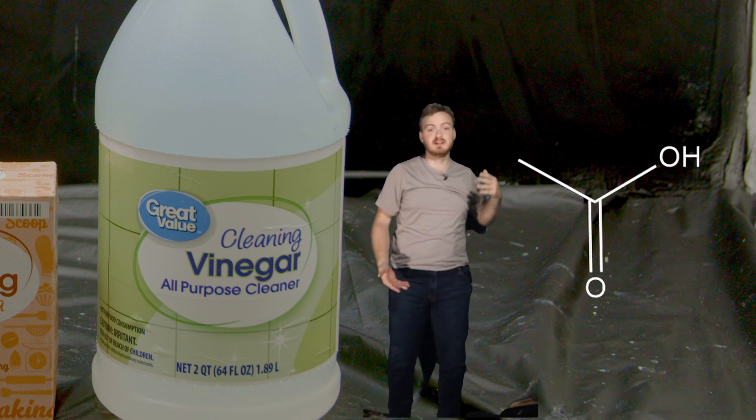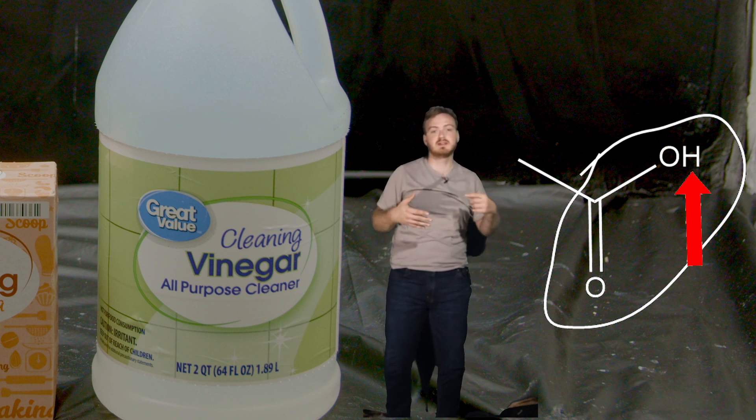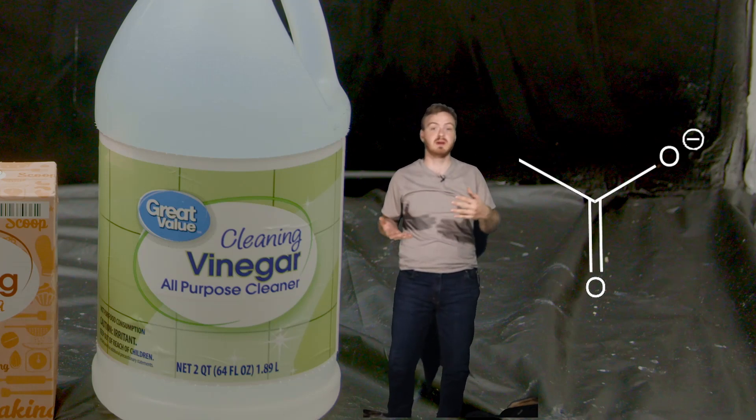You see, acetic acid contains a carboxylic acid group. This carboxylic acid group is really prone to losing its hydrogen, and if we can replace it with something, then we should be able to make a salt.